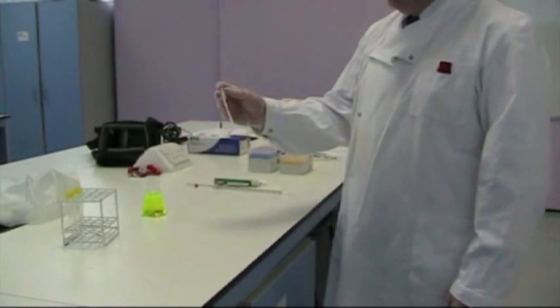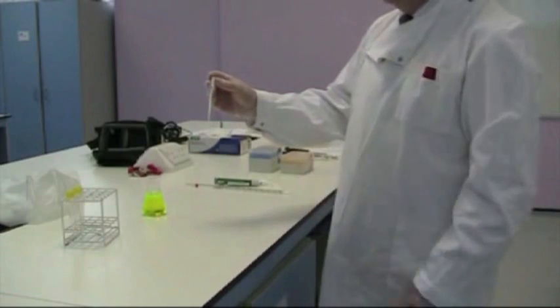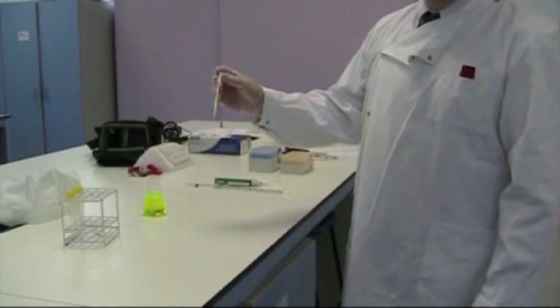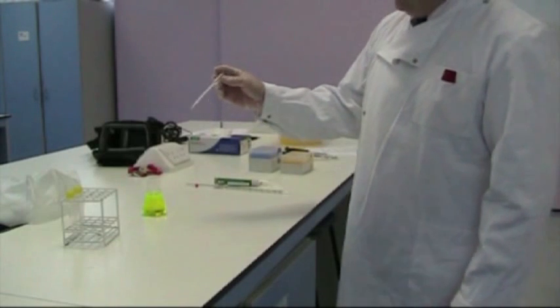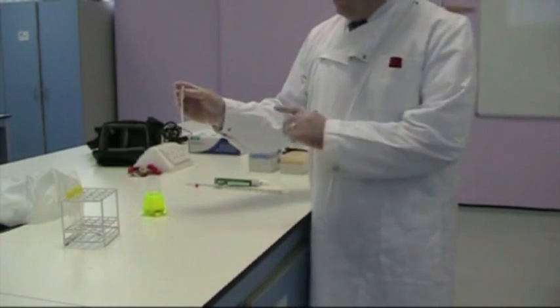Okay so the first one we're going to talk about is this one which is a plastic pipette and this one will dispense one mil but it isn't very accurate but it is quick. So if we need to dispense roughly one mil or half a mil then this is ideal.